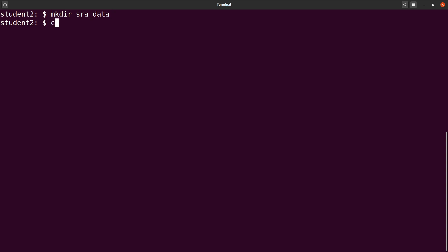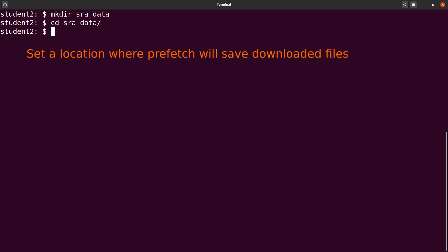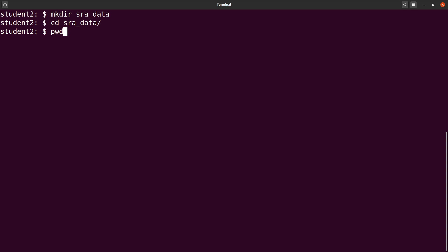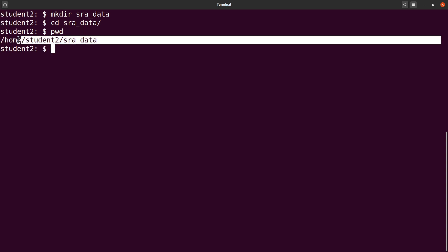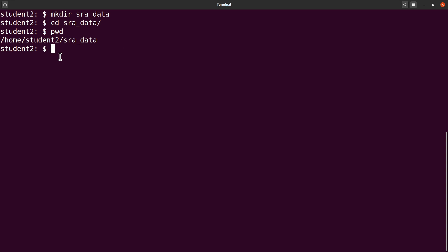The next thing to do is to configure the prefetch tool so that all downloads are saved in your current directory. So this is my current directory. When I do pwd, I get my current directory.